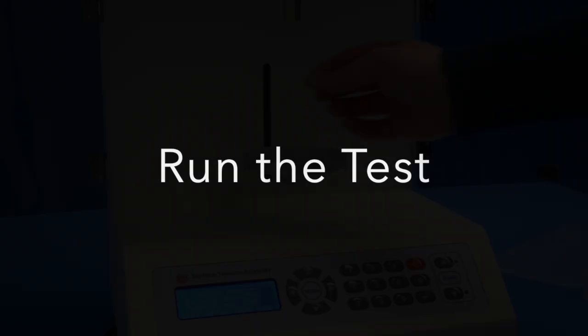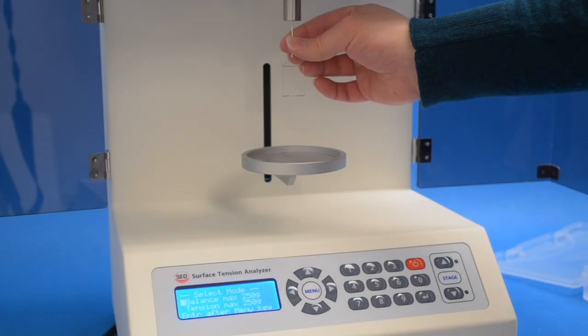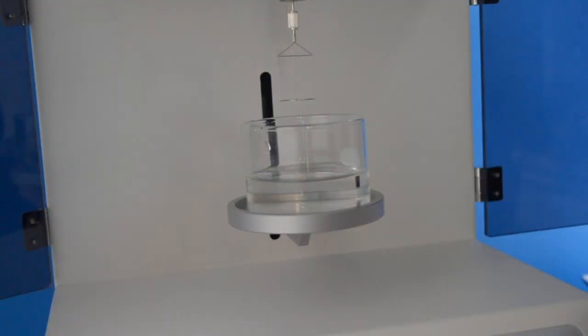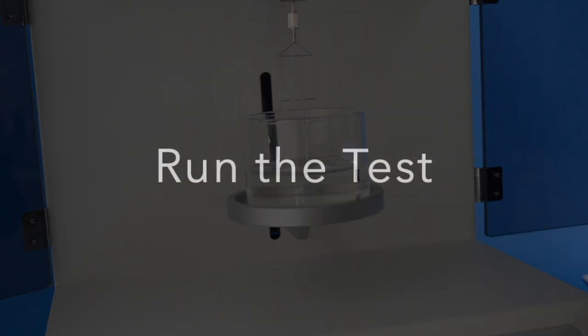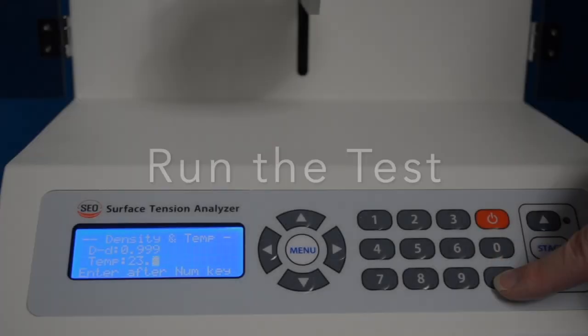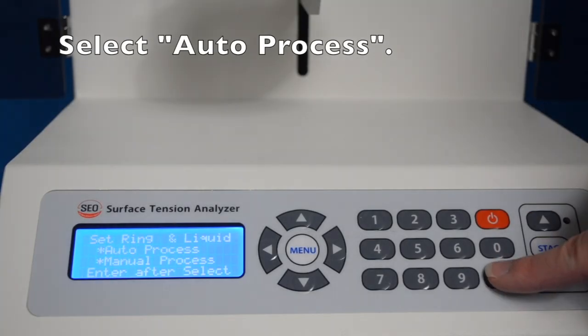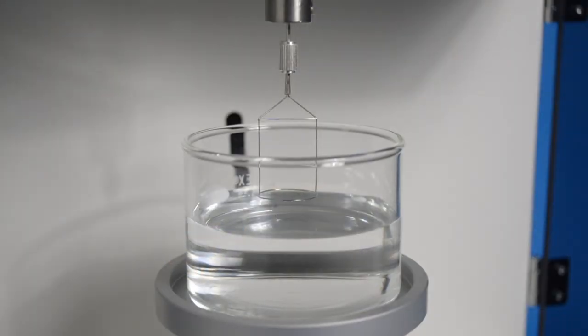Running a test has three simple checkpoints. The first is to be sure the ring is inserted. Number two is that your sample is loaded on the stage. When you're ready to start the test, simply select autoprocess.